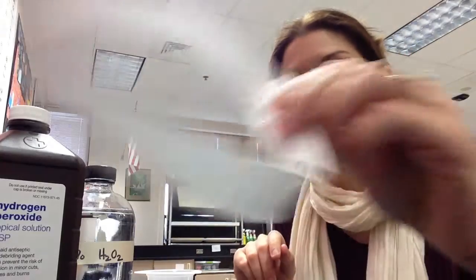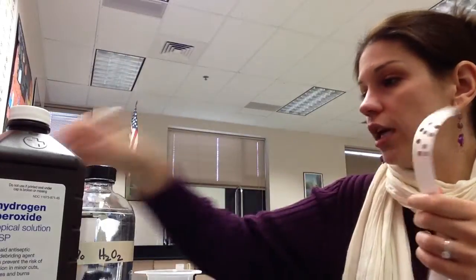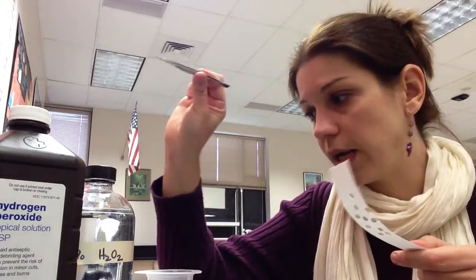Okay, so here's what we got going on. You're going to get a piece of, this is actually chromatography paper. It says filter paper in your lab notebook, but this actually works just the same way. And in your inquiry tub, you'll find a hole punch. There are not forceps in your inquiry tub because I use these for my other class too, so don't put these back in your inquiry tub, give these back to me.